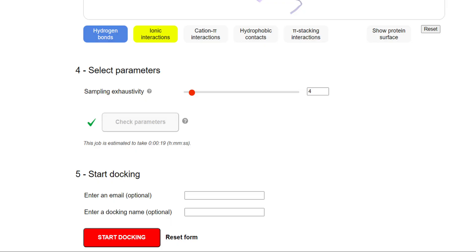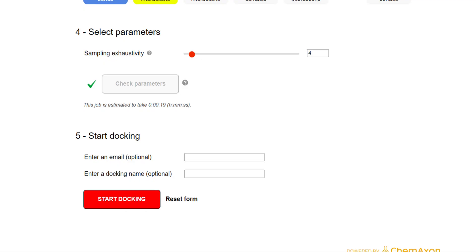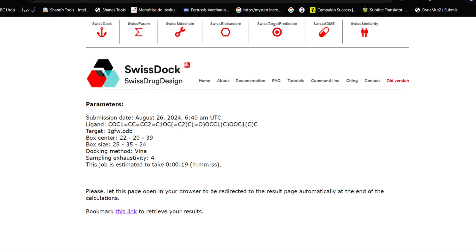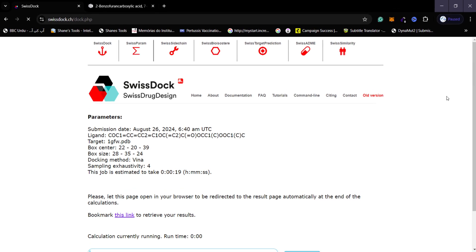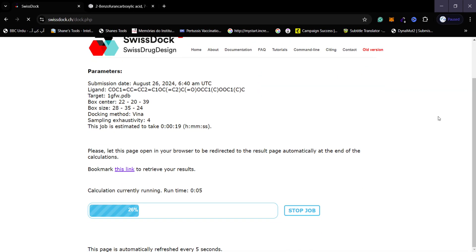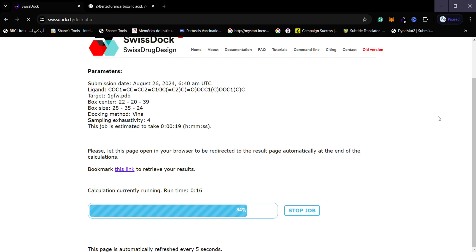In step five, you can optionally provide your email address and set a name for your docking study. If you provide an email, a link to the docking results will be sent to you, but this is optional. Once everything is done, click 'Start Docking'. The interface will change and you will see a progress window. Within a few seconds, your docking will be completed.